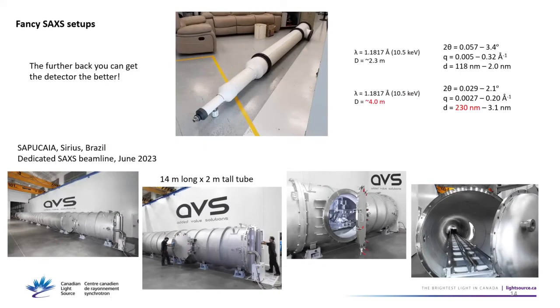And you can get even fancier with this. You might wonder, how far can we move the detector back? The longer, the farther, the better. At the low energy beamline, we hit the wall. I've actually made a longer tube for our undulator beamline that's 4 meters long, so we can probe a Q of 0.0027 and see much bigger things. We're eventually going to test this out there.